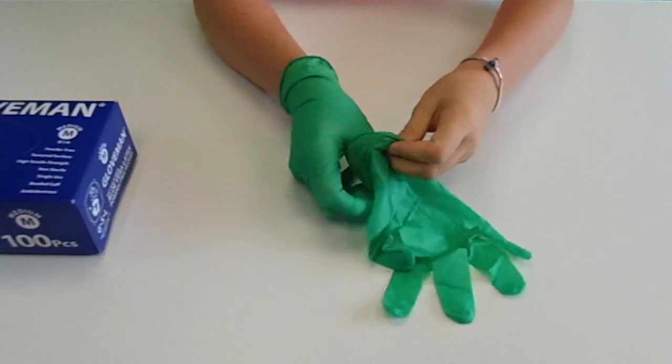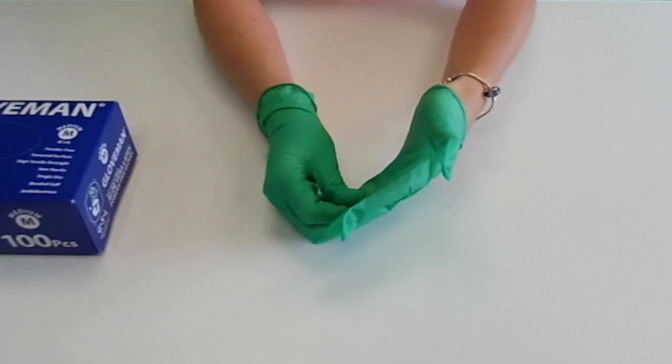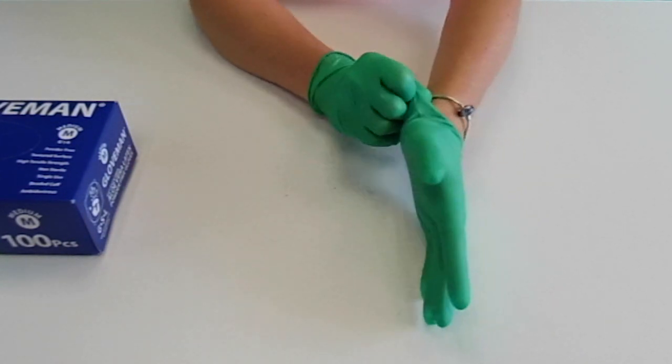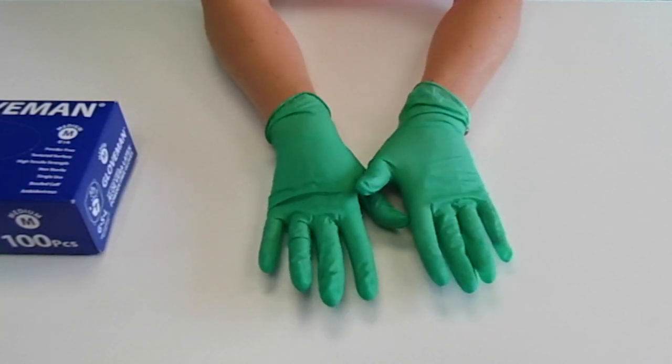They come in sizes small to extra large. Gloveman Aloe Vera latex powder free gloves are classed as a type 1 medical device conforming to EN 455 parts 1, 2, 3 and 4.